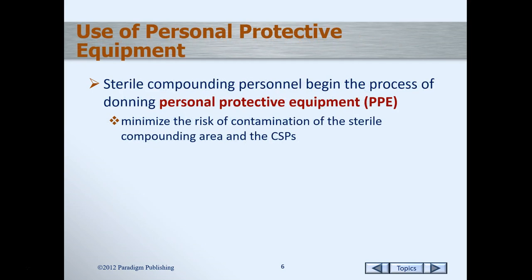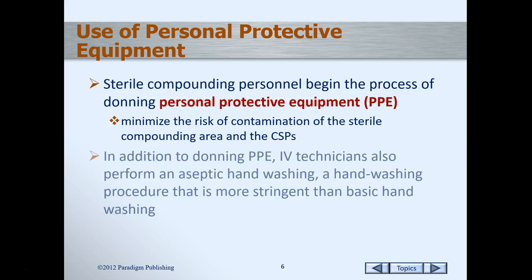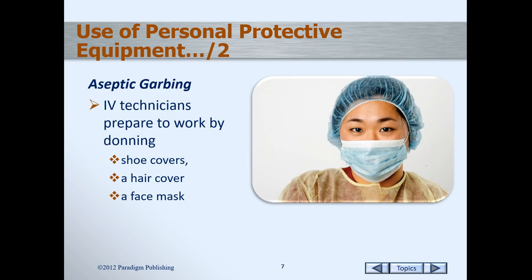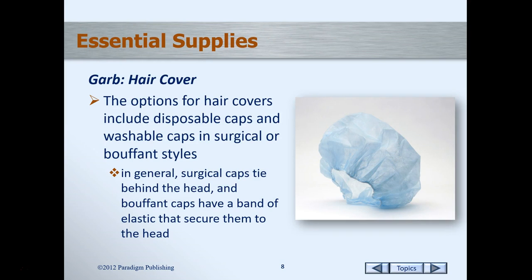Sterile compounding personnel begin the process of donning personal protective equipment, or PPE. This is to minimize the risk of contamination of the sterile compounding area and the compounded sterile preparation. In addition to donning PPE, IV technicians also perform an aseptic hand washing, a hand washing procedure that is much more stringent than a basic hand washing. The PPE that a technician will wear prior to the hand washing includes shoe covers, hair cover, and a face mask. May also include a beard cover. So let's review these essential supplies.